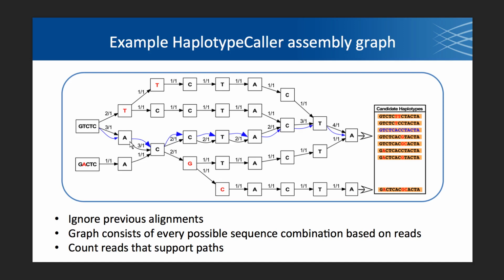And so the way we're representing it here in the graph is each of those single letter nodes are the new base that we're adding, and then the previous bases from the other nodes until you get to that 5-length sequence. And so the blue pair here represents the reference, which is how we're going to start. And then for each of our quote-unquote reads in this toy example, we chop those up into 5 base pair segments and add them to the graph.